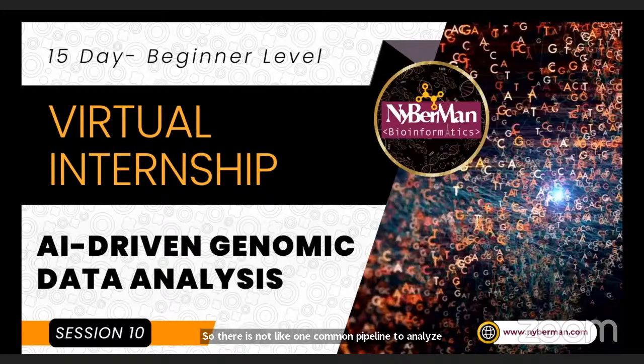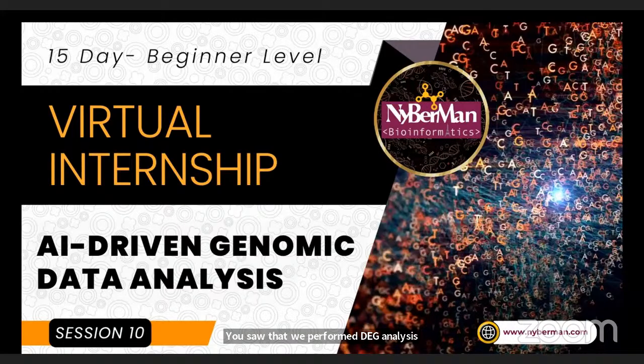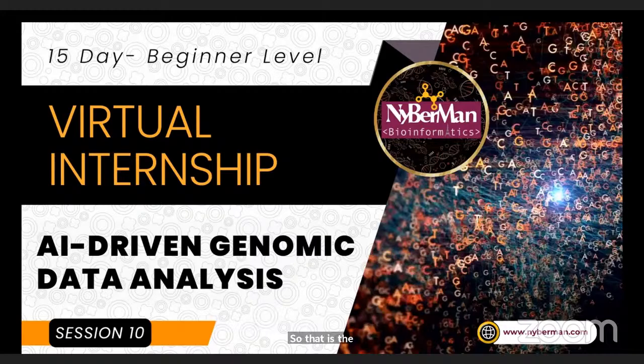For example, while performing the analysis, you saw that we performed DEG analysis using the limma package, right? That is the limma tool, but there are other tools like DESeq2, then there is edgeR and other tools. So depending on what pipeline we want to follow and which tool we want to use in our pipeline, that's how the pipeline changes.